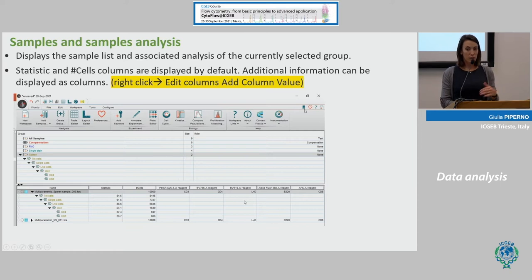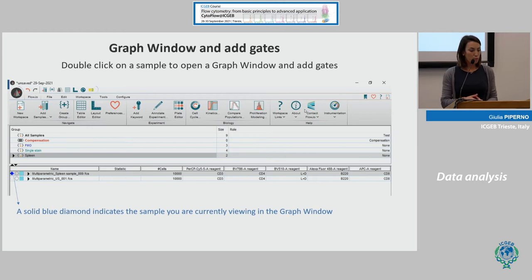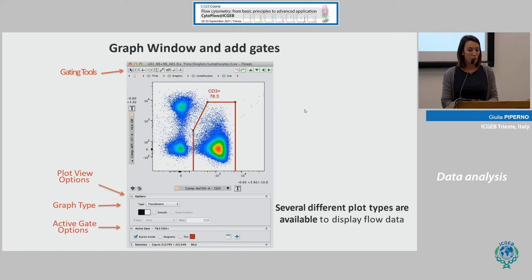Here I added the color and markers of the staining for the samples we have today. To start analyzing, double-click on your sample. You will see that the diamond icon that was gray becomes solid and blue, indicating that you are now working on that sample. A new window will open divided into different parts.